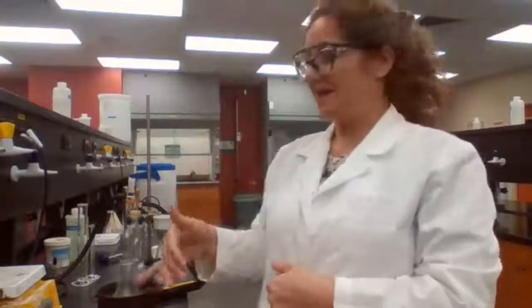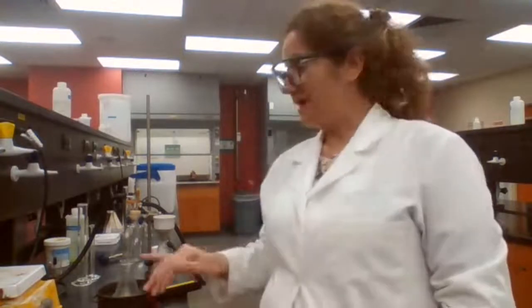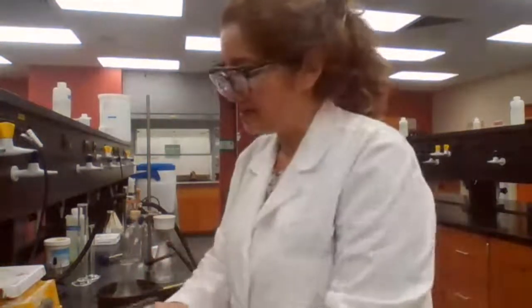If I set the oven temperature high, basically at the melting point of the crystals or close to it, then my crystals are going to melt in the oven. So I have to make sure that the heat is sufficient to evaporate the solvent, and at the same time, it doesn't melt the crystals. So the melting point of the crystals, anybody has the melting point for the crystals?